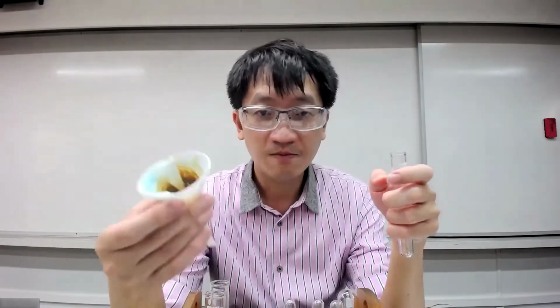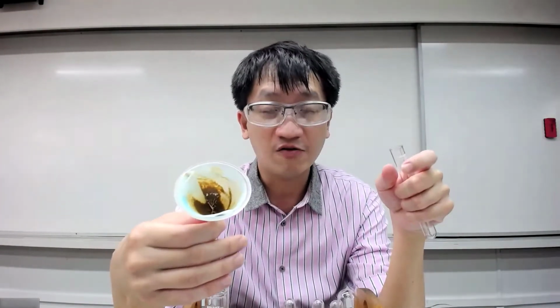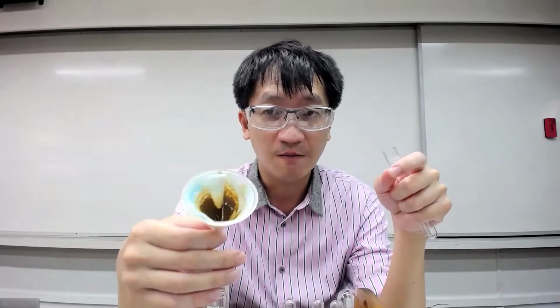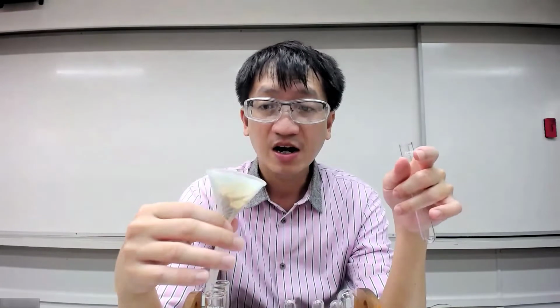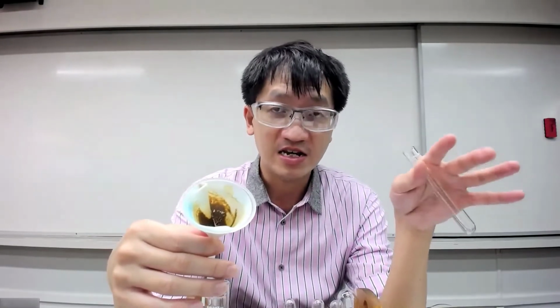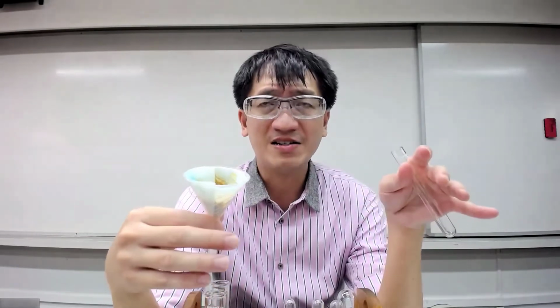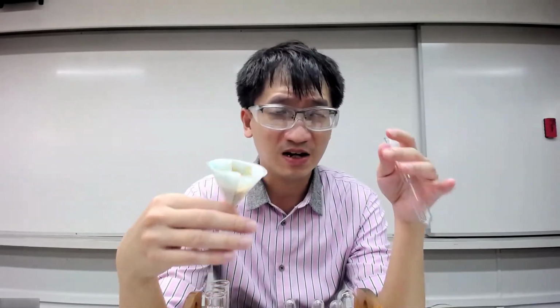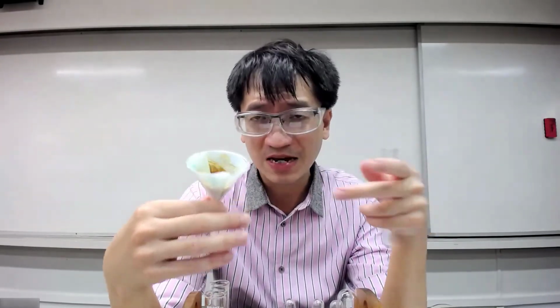At this point, you should know the identity of the reddish brown residue. It should be iron(III) hydroxide. Some of you in your practical thought that the unknown cation is iron(II) because you saw the green mixture becoming reddish brown.